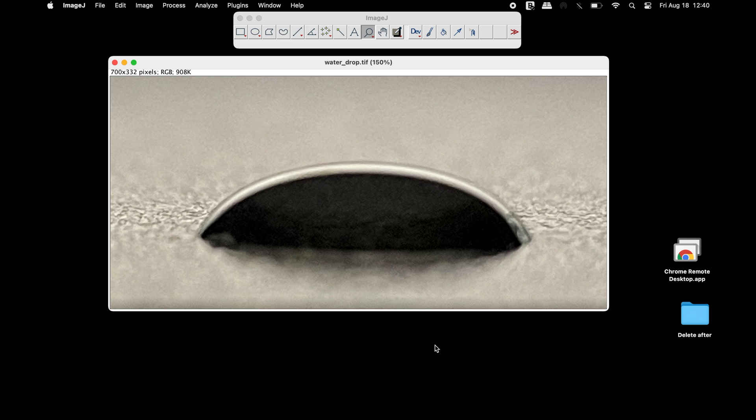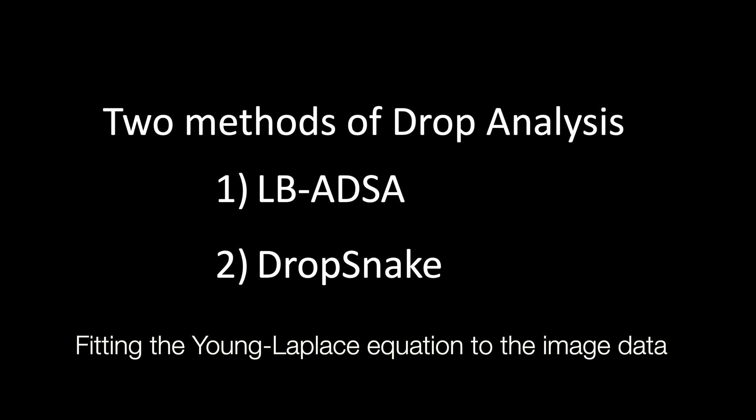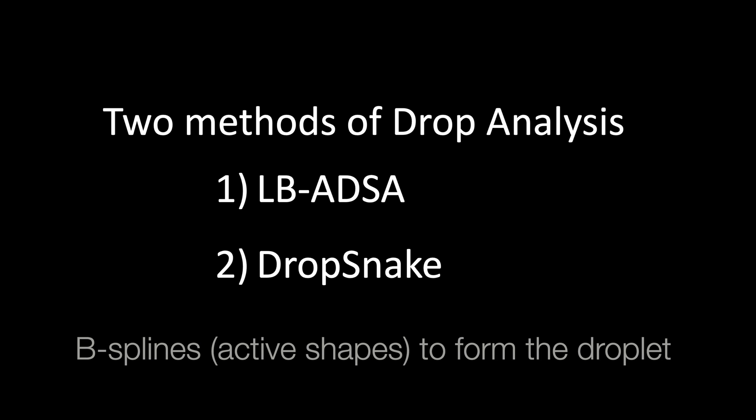Here is an image of a water drop, and we will use ImageJ to measure the contact angle. Two methods of drop analysis will be used for the calculation: the LBADSA method, which is based on fitting the Young-Laplace equation to the image data, and the Drop Snake method, which relies on B-splines — that is, active shapes — to form the droplet.